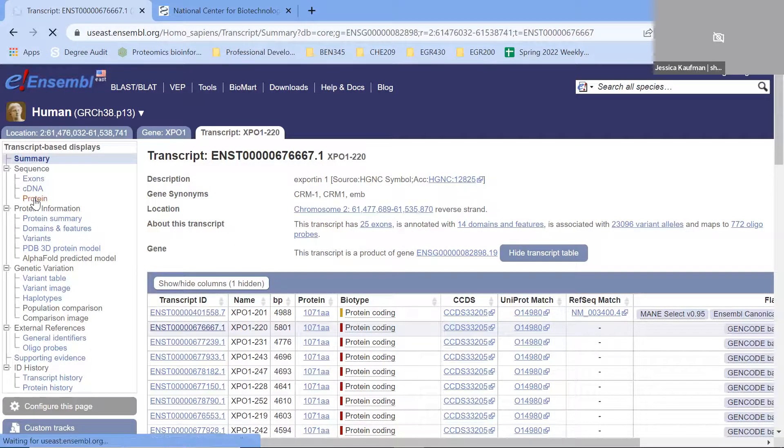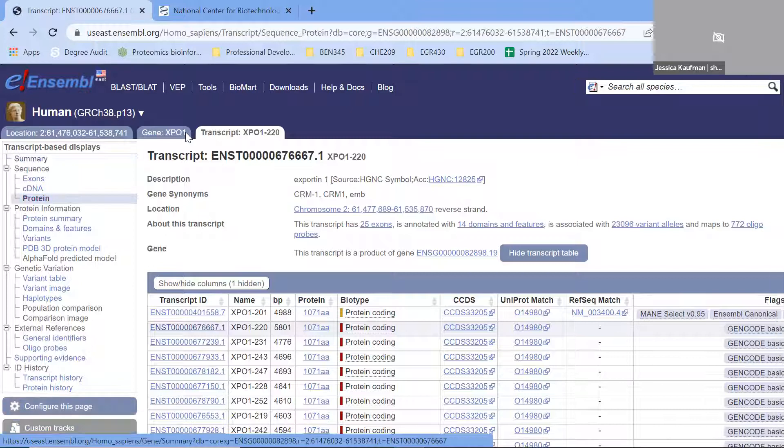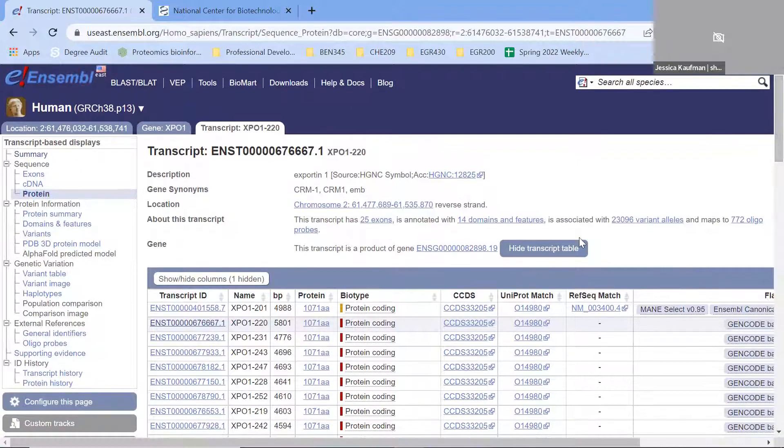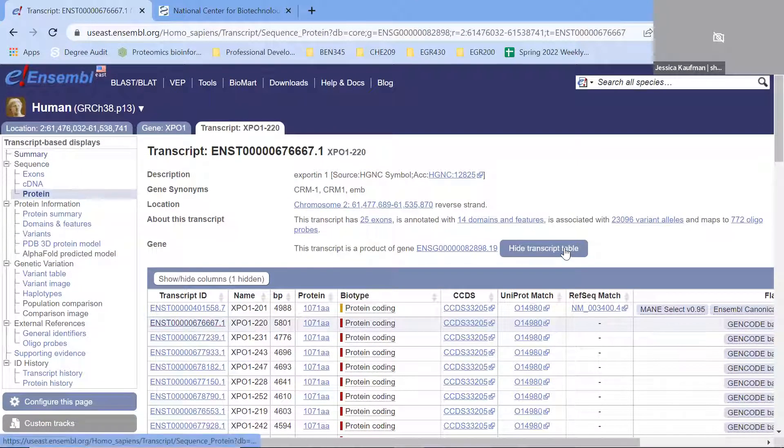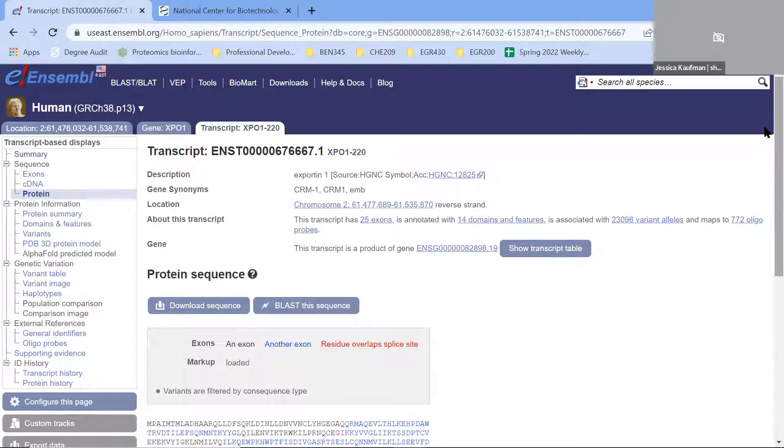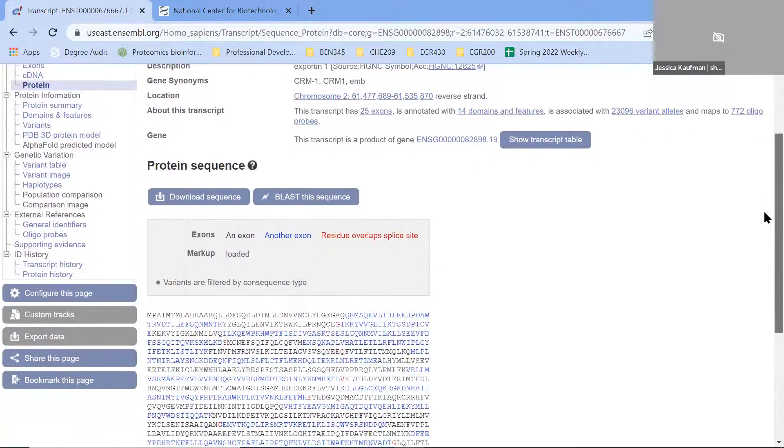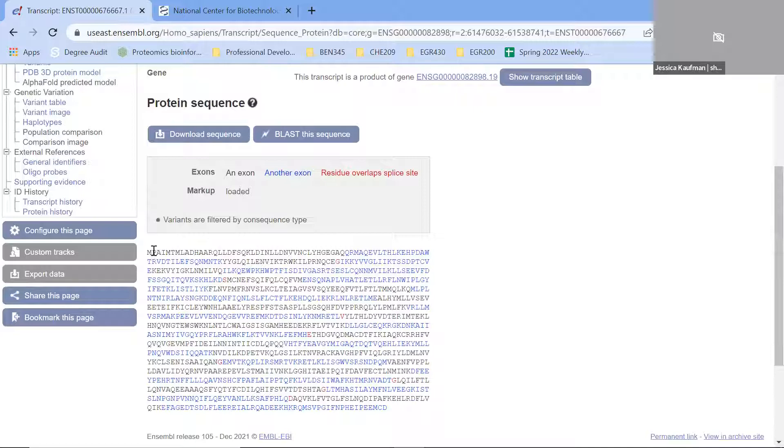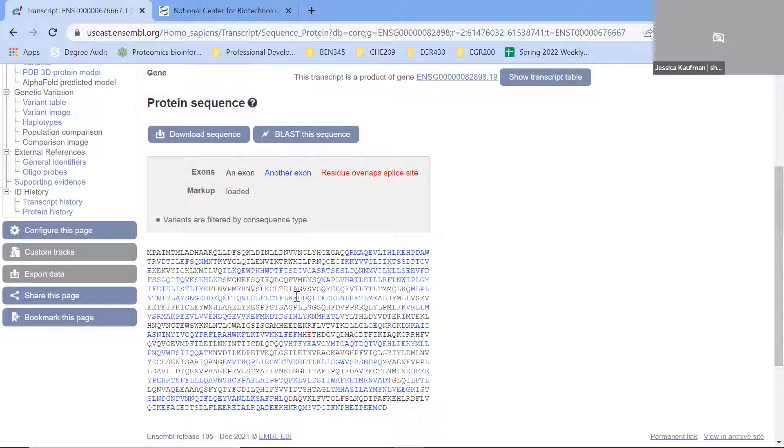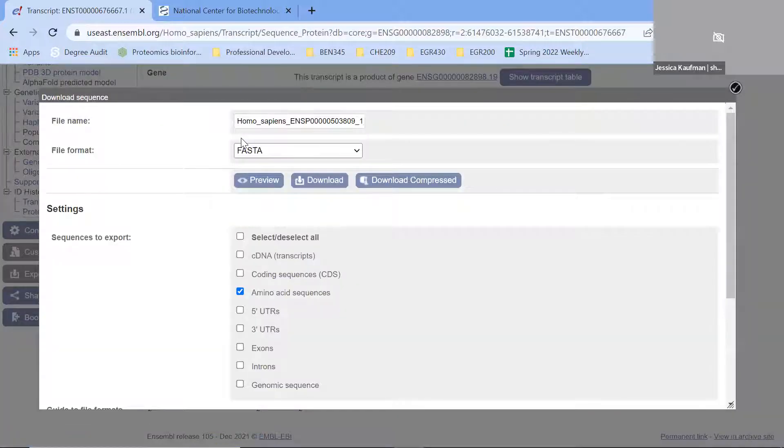When I click on the protein, I can either hide the transcript table to see the protein or scroll below the transcript table. The protein shows up here, and we can see that it starts with our start codon, methionine. We have the whole protein sequence, and I can download it as a FASTA file.